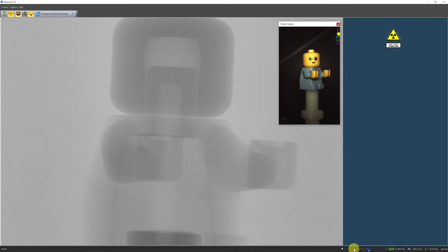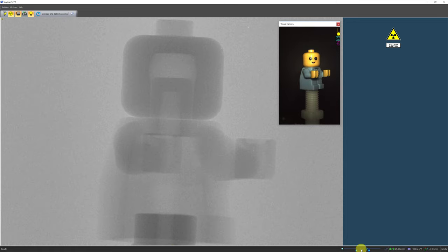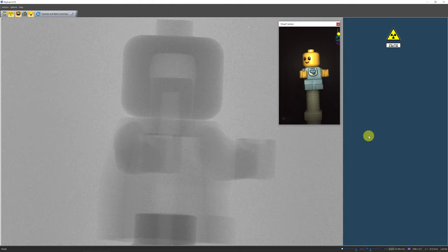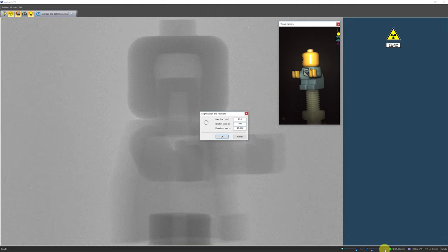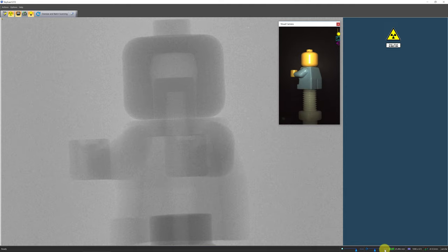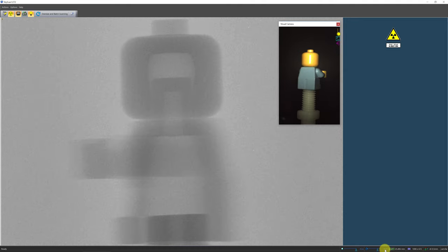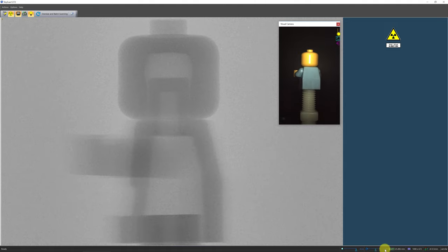You can also call out the magnification and position dialog by a single left click on the pixel size column number and manually type in the desired pixel size. Once you select the lowest possible pixel size that can fit the entire object in the field of view, check the sample at 0, 90, 180, and 270 degrees to make sure that when the sample rotates, it is still within the detector's field of view. Regions that rotate outside the field of view during acquisition will be cut off and cannot be reconstructed.